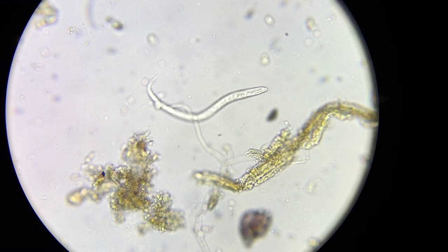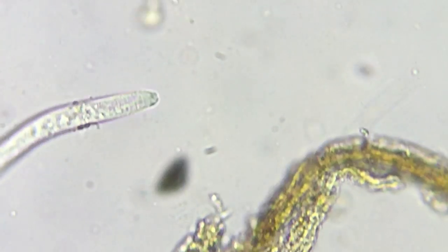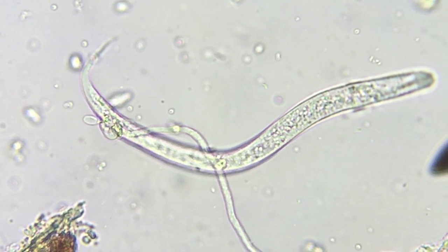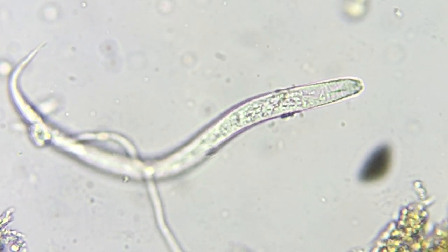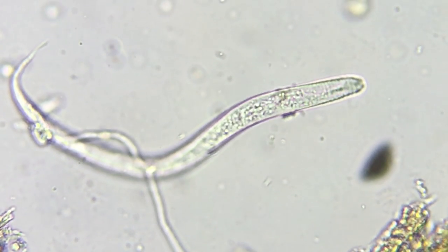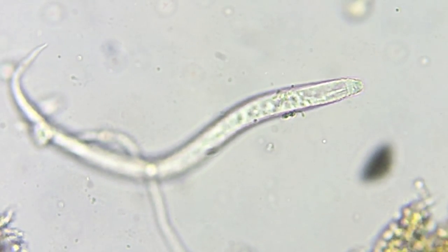We get a better view of its mouth. Anyway, nematode-killing fungus. The guts are all granular with bacteria, so it makes it hard to ID, but it's got those sort of rings around it. Looks a little like crichenema. Very cool.